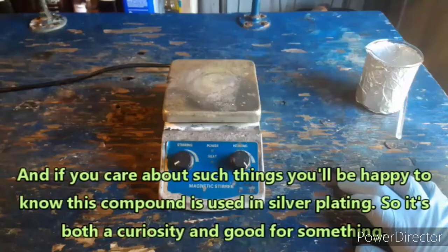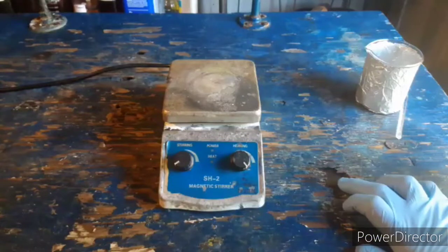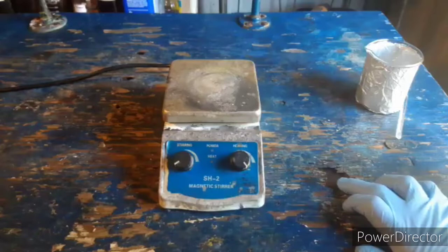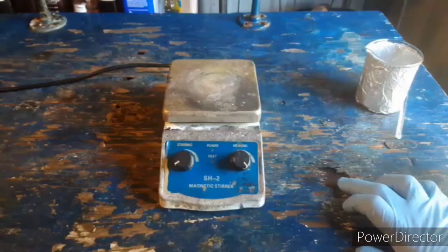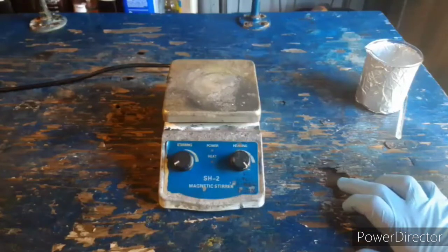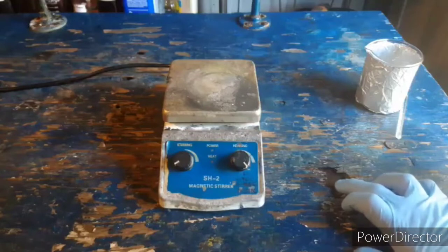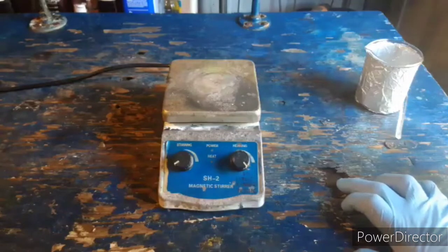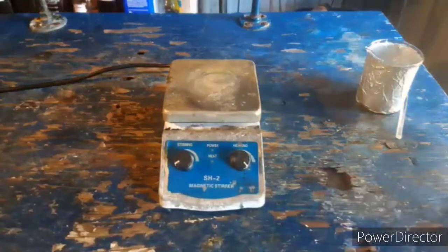I thought I would begin the video with the story of the hot plate, for those of you that hadn't been following it on the YouTube community post or didn't catch it in the last video. This thing died. I had been working with dissolving silver in nitric acid — you can see aerosol droplets got all over it and turned colors in the sun — and it finally just stopped turning on. My roommate fiddled with it for a while. Sometimes the stirring turns on but the heat will not. I'm not going to use it during this prep.